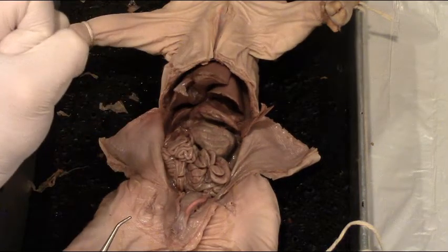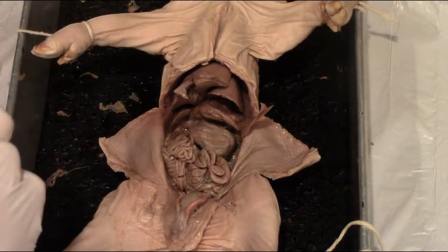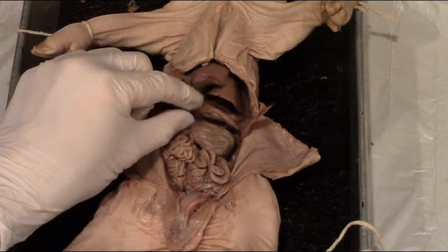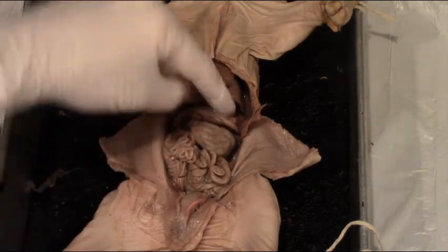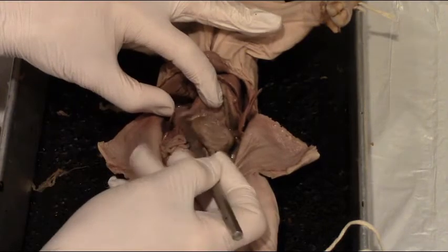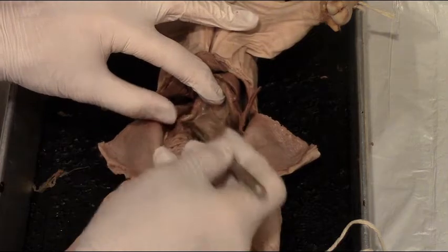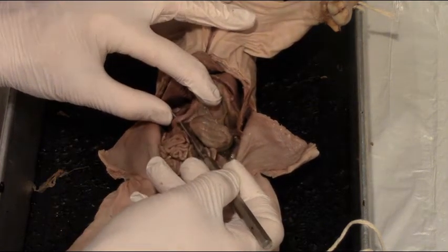The pyloric sphincter is a muscle that opens and closes to let food — or partially digested food — from the stomach into the top of the small intestine. So the pyloric sphincter is the divider between the stomach and the topmost portion of the small intestine called the duodenum. You can use a probe to tease some of that connective tissue away to see the duodenum.